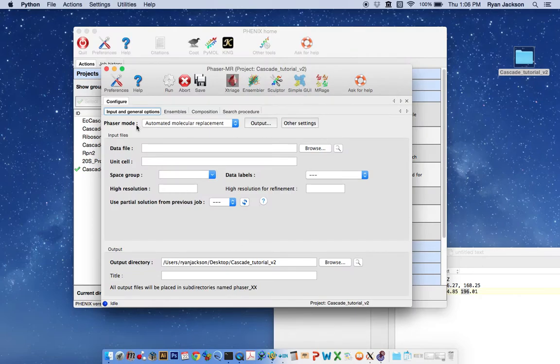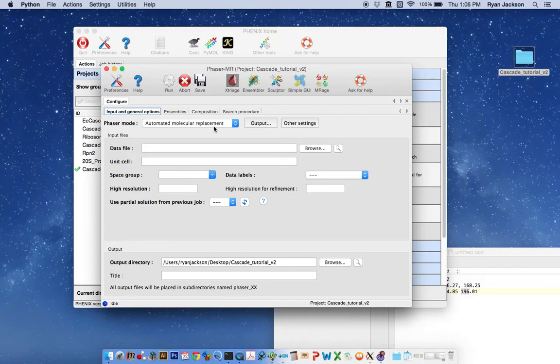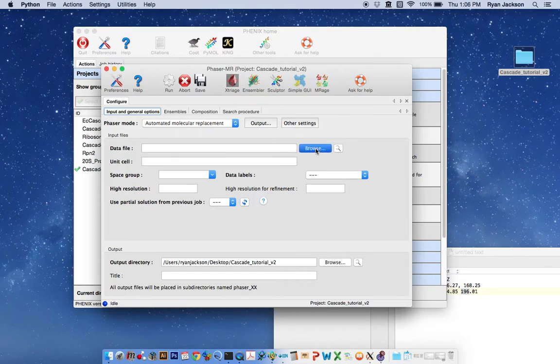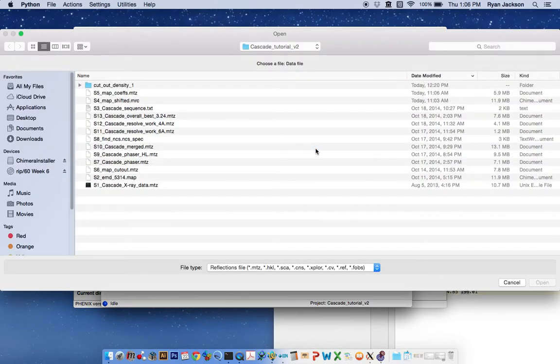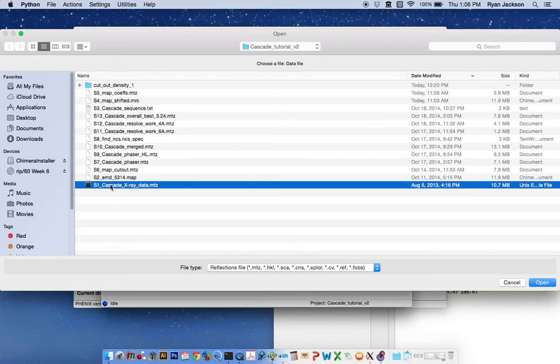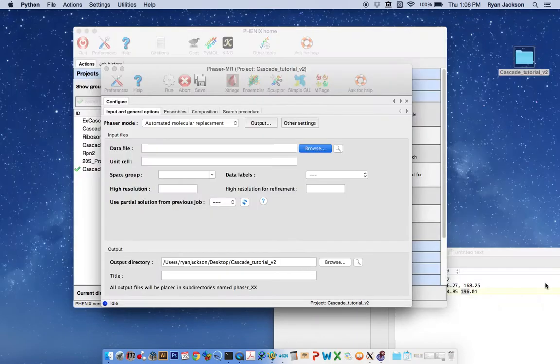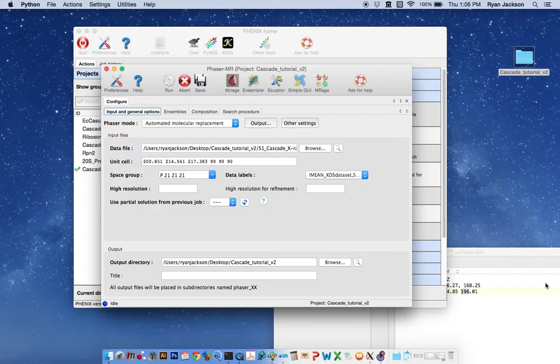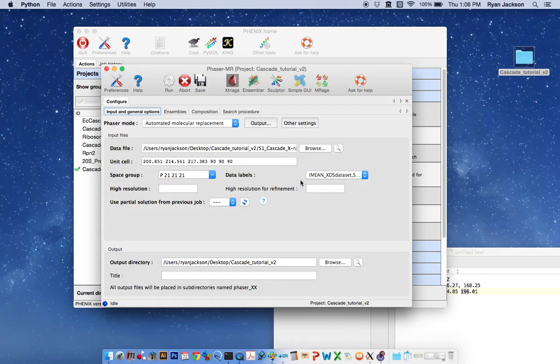The phaser mode is automated molecular replacement. Then here in the data file field we want to load high-resolution X-ray data, which in the case of Cascade is supplemental file 1. The unit cell dimensions and the space group should automatically populate.